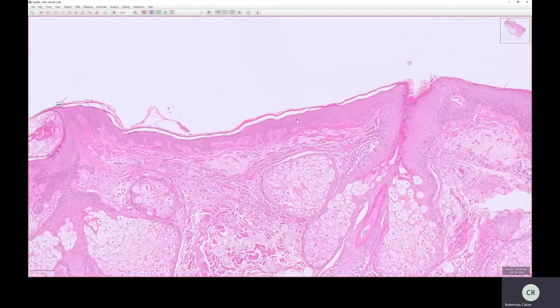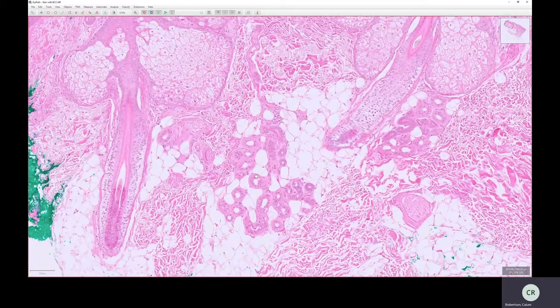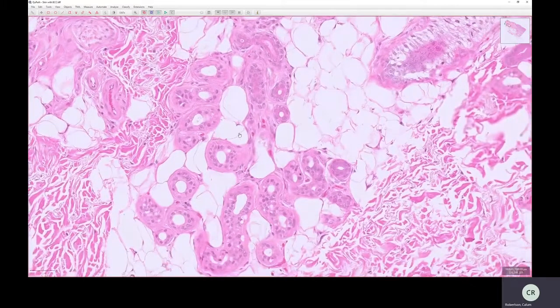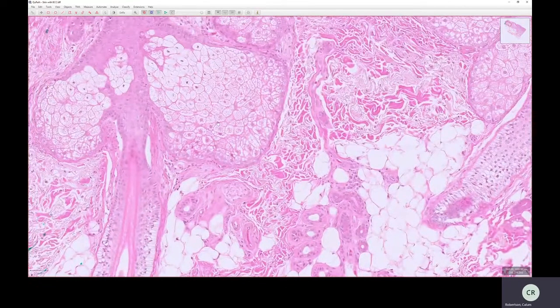And that's squamous epithelium. We've got another type of epithelium here, which is glandular epithelium. There are different types of that, but here, if we look down here, these are sweat glands, and these are made of glandular epithelium, which is different from squamous epithelium. The purpose of glandular epithelium is not protective, it's not to form a barrier, but usually they produce things. Glands produce things, where in this case, they're producing the sweat secretions. This is a different type of glandular epithelium here.